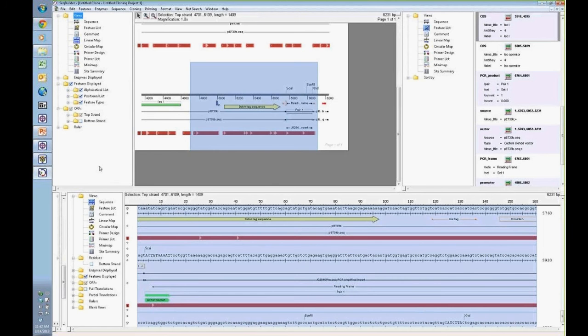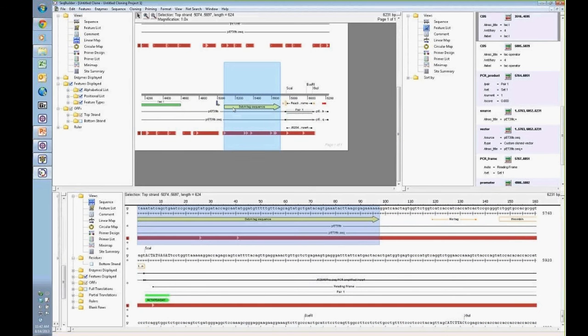Great, thanks, Brian. Okay. All right, so what we've done here is we have our clone. Our clone has been inserted in a PET 39B. So the next logical step is now I want to take a look at the translation of this.